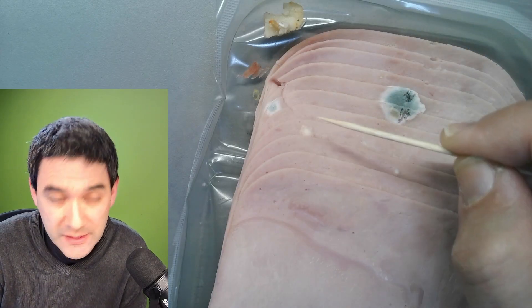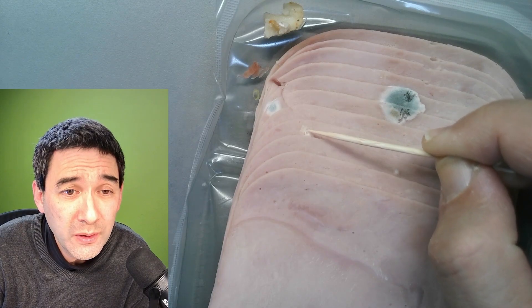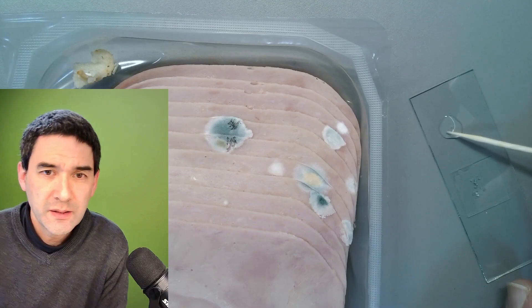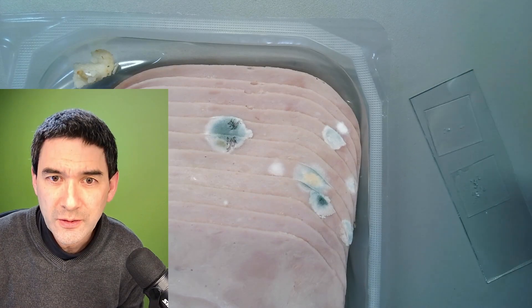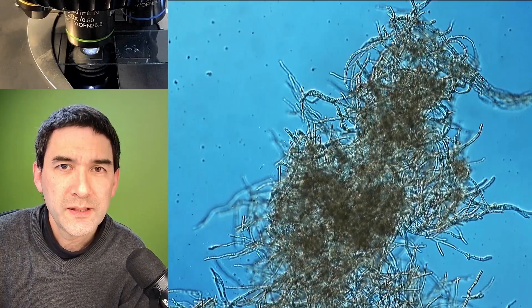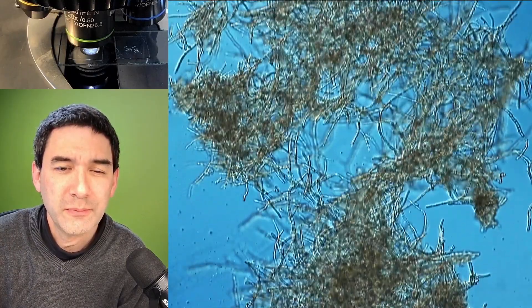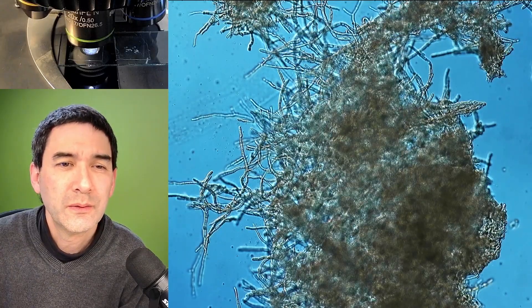Let's try another one — this one over here. I wonder if this is also a fungus or maybe a bacterial colony. I'm not quite sure. And the cover glass goes on top. Here we go again. No, that's basically also a fungus — okay, not a bacterium. Not a bacterial colony.